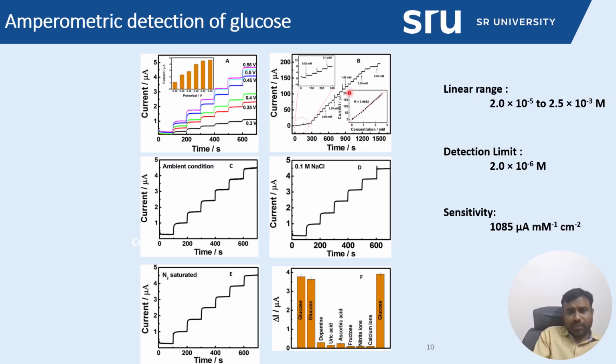So it is confirmed that the fabricated copper sulfide electrode has good catalytic and sensing properties. When compared to copper sulfide derived from pure water and pure ethanol, the copper sulfide derived from the water-ethanol mixture has good electrocatalytic and sensing properties. Similarly, we have performed the better performance of the modified electrode.